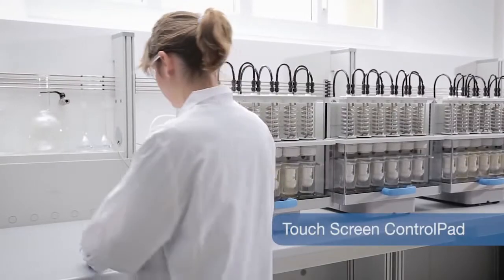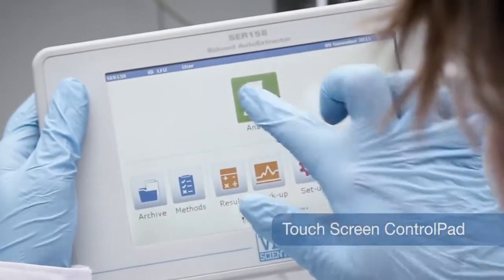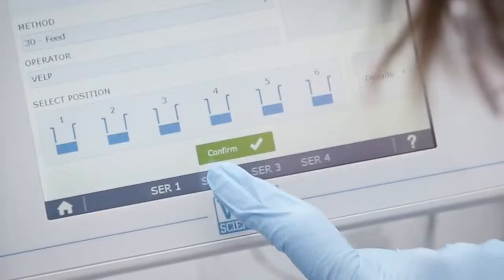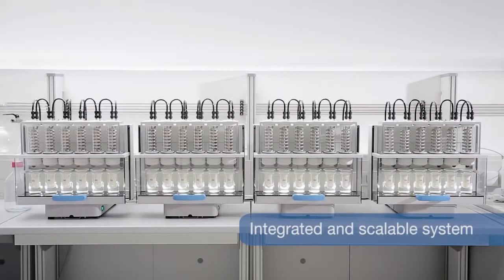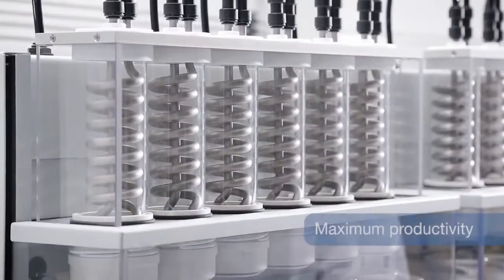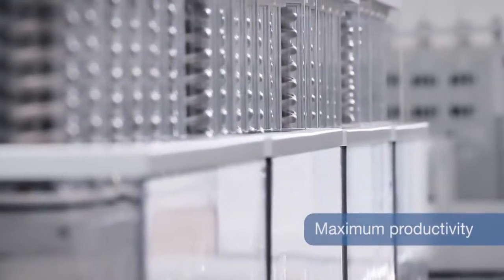The control pad with 7-inch touchscreen can control up to 4 S.E.R. 158 units, ensuring a truly scalable system and high productivity, leading the market with up to 24 different analyses simultaneously.